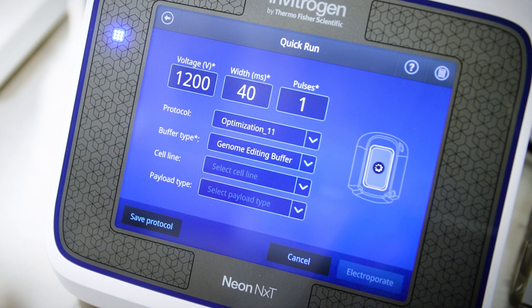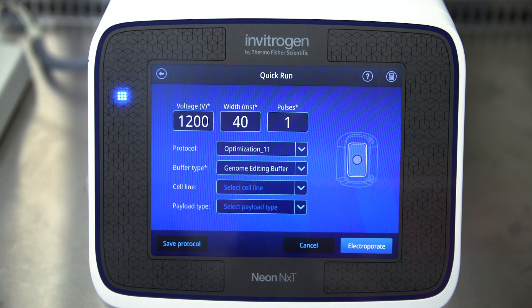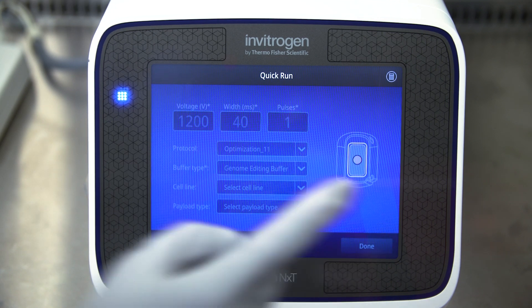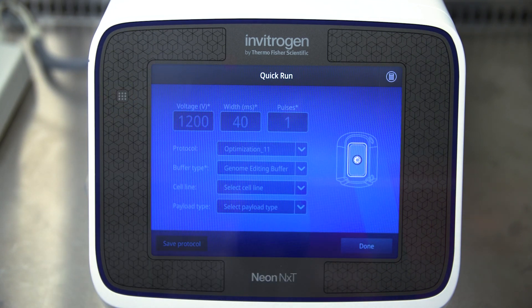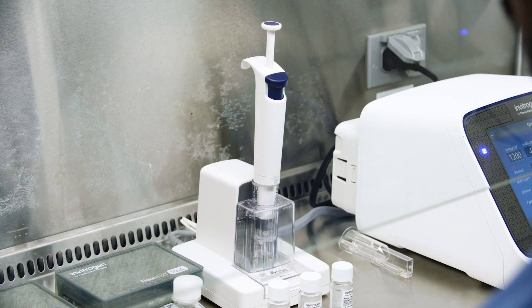Also, there will be a solid blue circle on the screen to let you know that you are now ready to transfect your cells. Select your protocol and press Electroporate. Electroporation once completed is indicated by a green checkmark. Press Done. With these simple steps, your transfection is now complete.